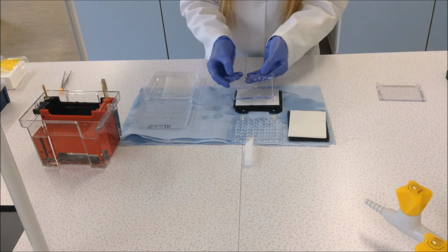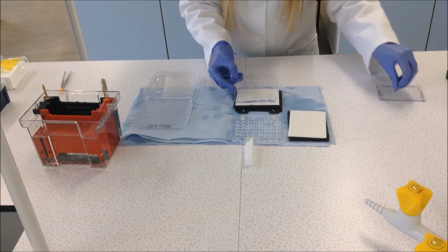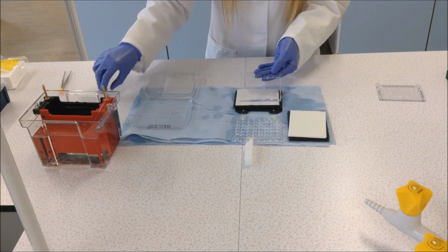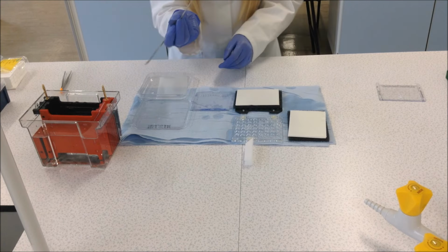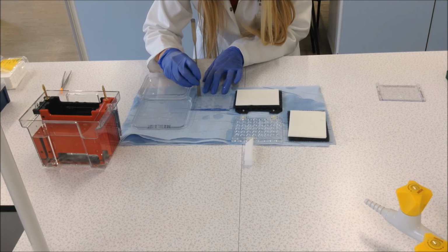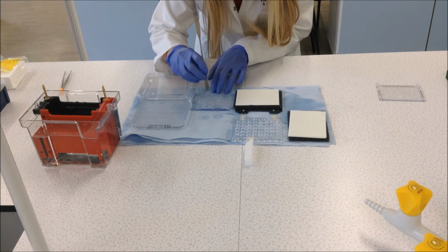After removing the first piece of plastic, you will notice that the polyacrylamide is actually stuck to the other piece of plastic. What we essentially want to do in the next step is to transfer the polyacrylamide onto the blotting paper. However, before we do so, we must remove any excess polyacrylamide. This can even include removing the wells that are located at the top of the polyacrylamide, as again, any lumps and bumps could interfere with the blotting process.